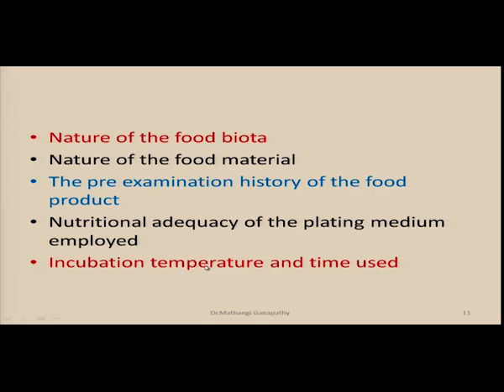The nutritional adequacy of the plating medium. What medium have you chosen for the microbes to grow? It should contain the carbon, electron and energy source for the growth of the normal microbiota, or the specific microbiota concerned. So that is the nutritional adequacy.